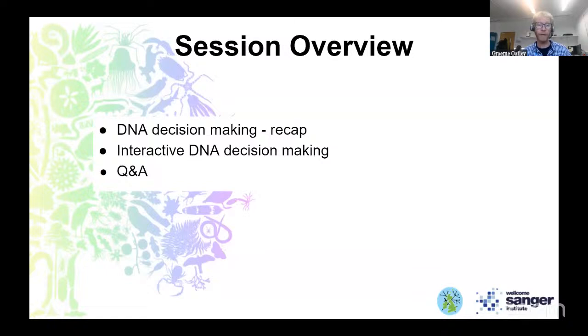We have a piece of software called Mentimeter, which I'll ask those who want to participate to log into. You'll be able to vote on various femto profiles, the yields of samples that we've extracted, and see how you would progress a sample down our pipeline. Then we can see the results and perhaps discuss things if people have questions about why we would make a certain decision. We leave it open-ended and see where it takes us.